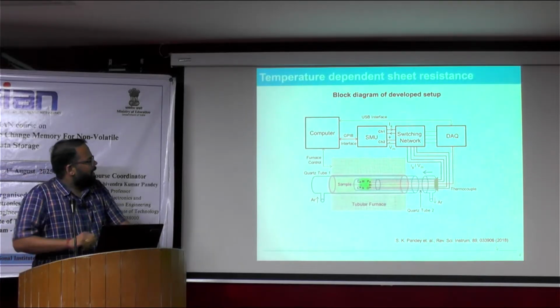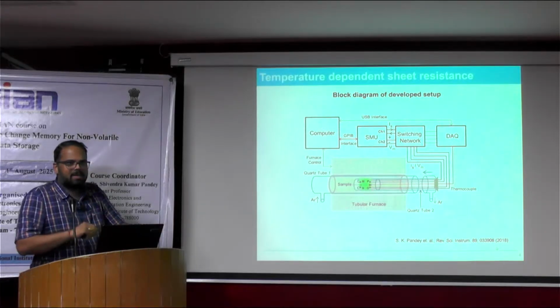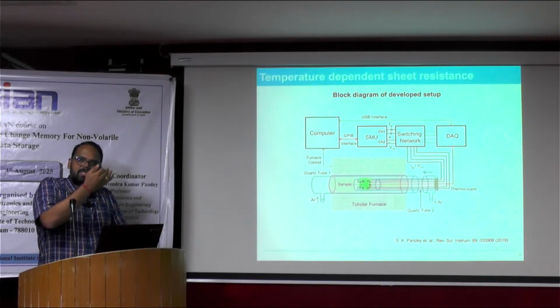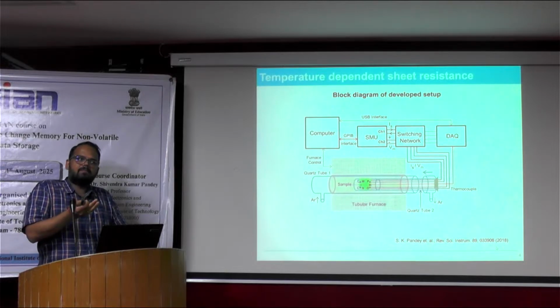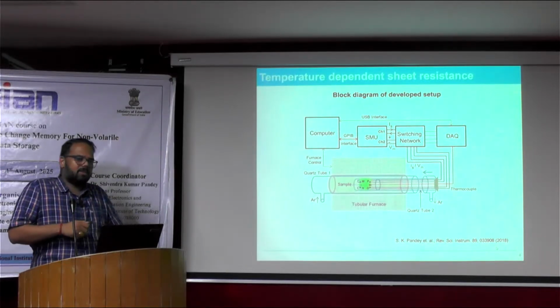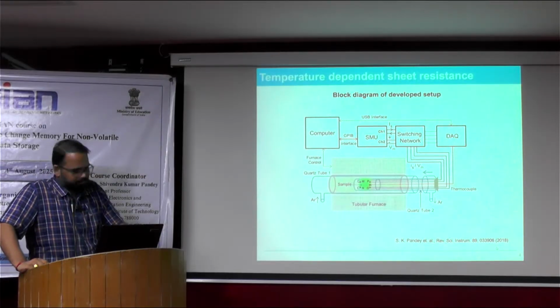how this thing is developed here. And then this whole thing is fully automated by computer, because you need to identify in situ measurement. You are heating the sample, and simultaneously you are identifying the resistivity also. So this is the overall way by which we can see this.